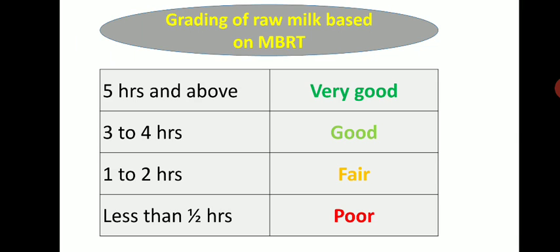So after addition of dye, if you keep the milk for 5 hours and above and it still does not decolorize, or it starts decolorizing only after 5 hours and above, then the quality of this milk is very good.